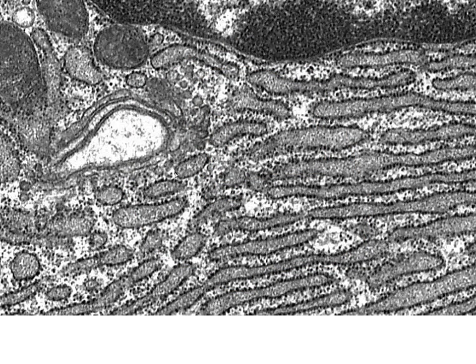Here we see some real high magnifications of our ER. You can see the granular look on the endoplasmic reticulum, and here you can see our Golgi apparatus, and we have our transport vesicles coming off of the Golgi here. You can see some more of those Golgi's transport vesicles here.